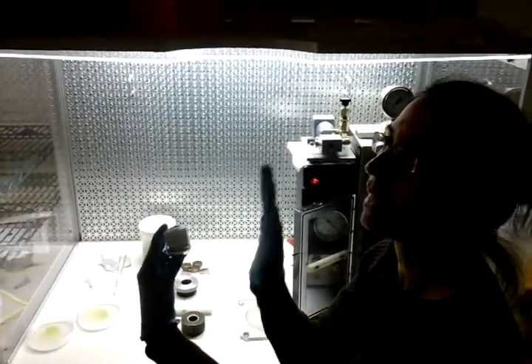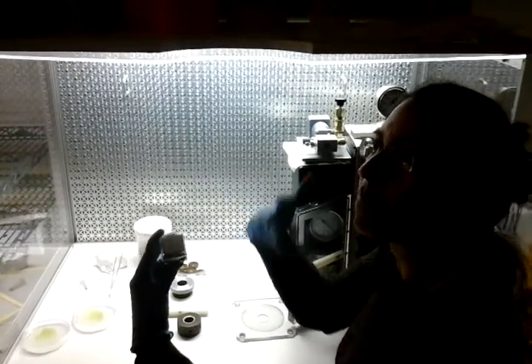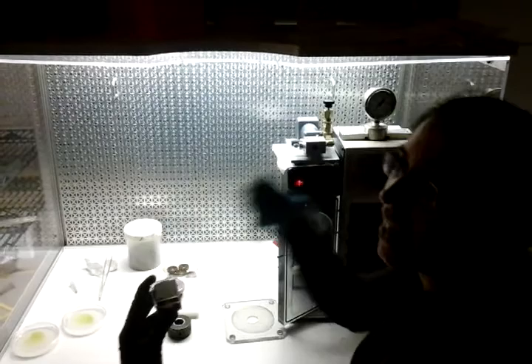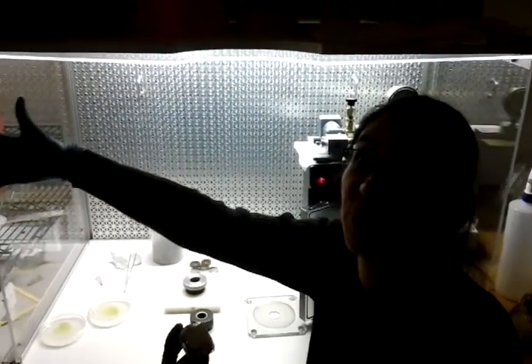This disc will remain intact, but as soon as we build up the pressure of air behind it, at some point it will fail and all the air is going to come rushing through.